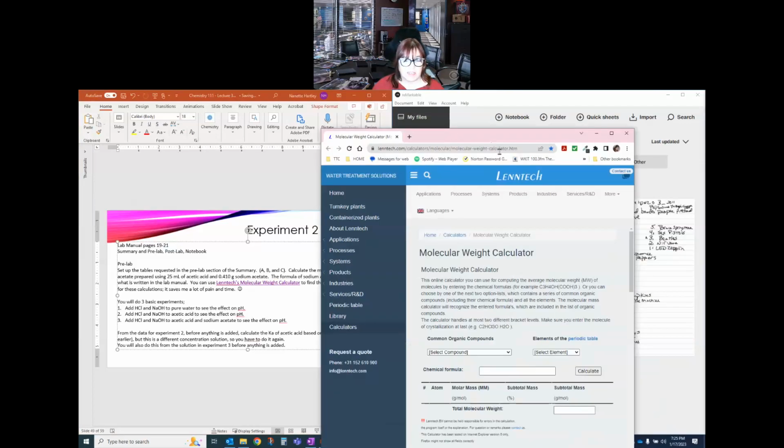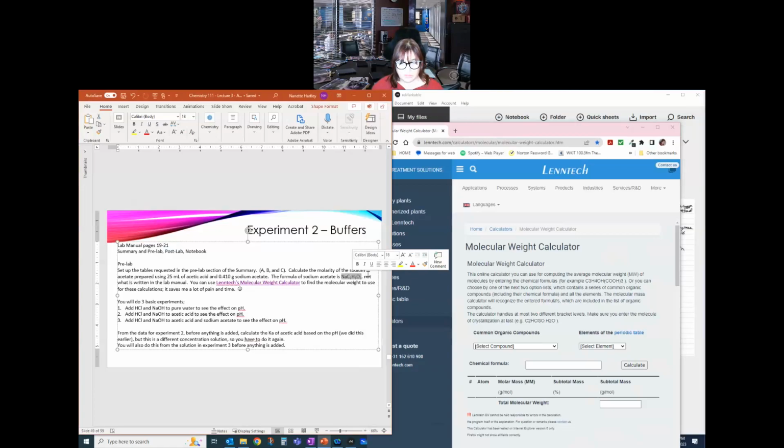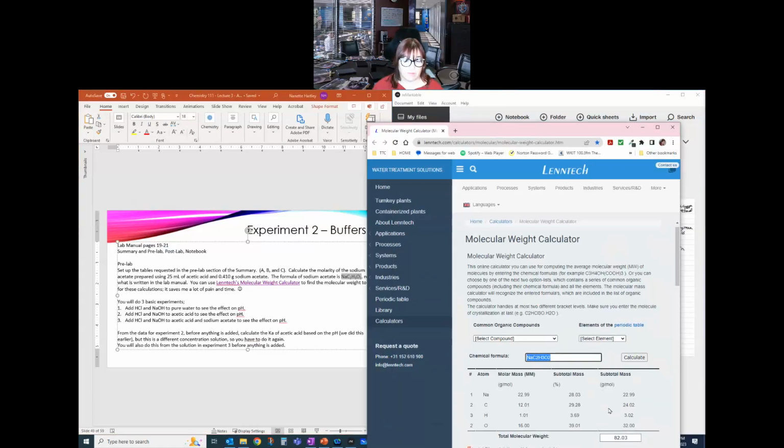And this is Lenntech. You can type that formula in, the one that we have right here, hit enter, and it will calculate that for you.